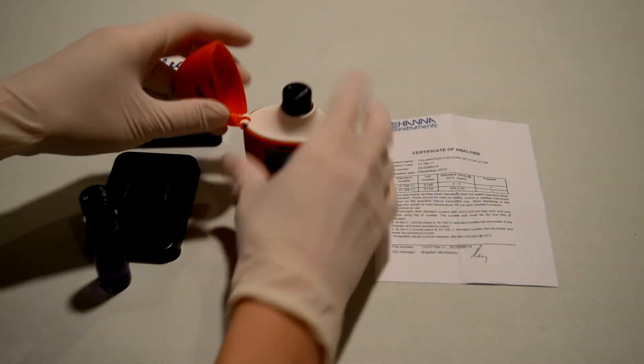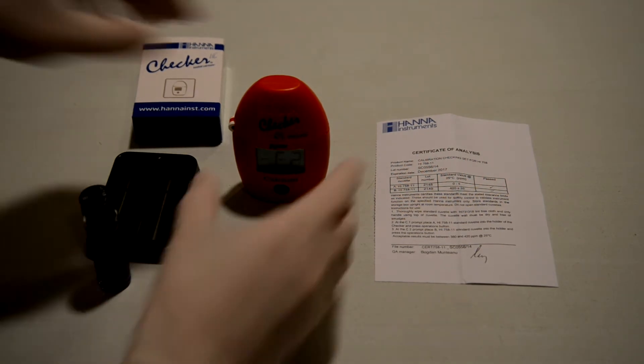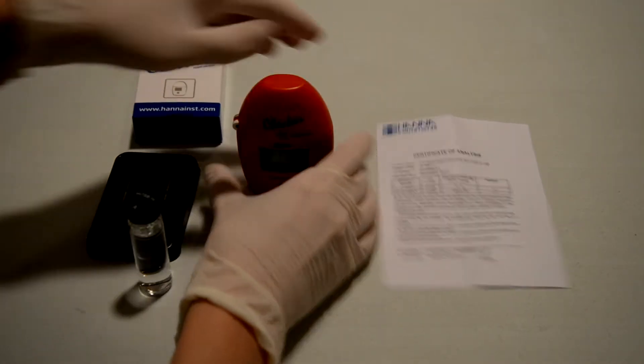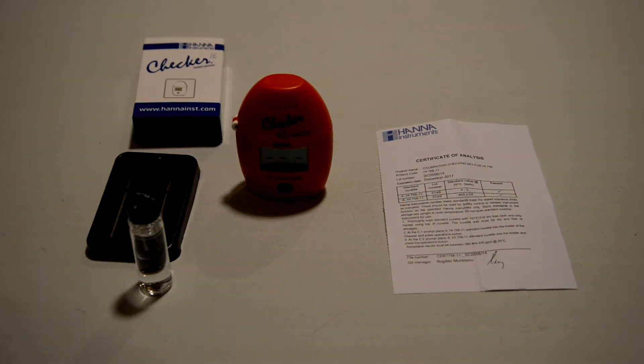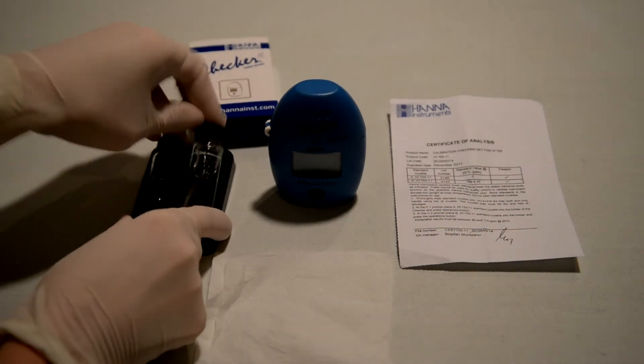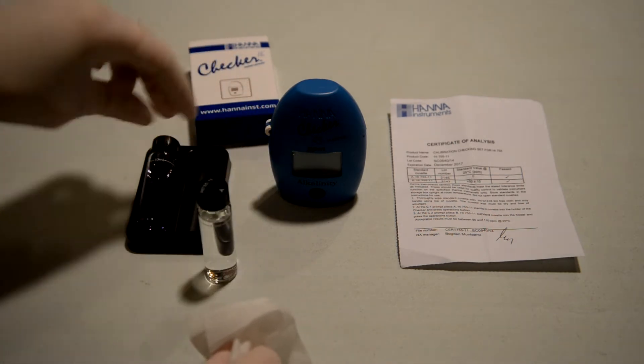The good part is you'll get to make sure that your checker is testing within the range it's supposed to, based upon the analysis they give you in the calibration kit. That one was 403, so it's right on the money. You can do the same thing with the alkalinity one and make sure these units work properly.